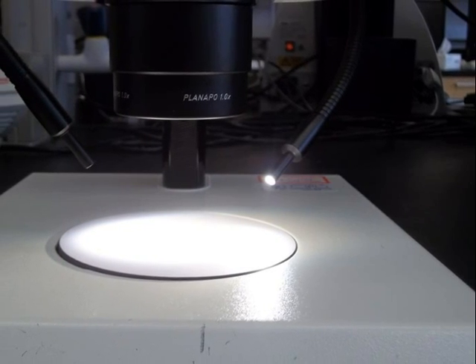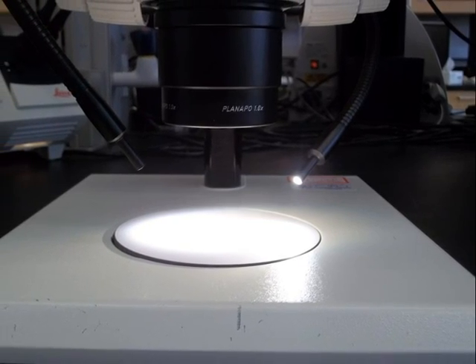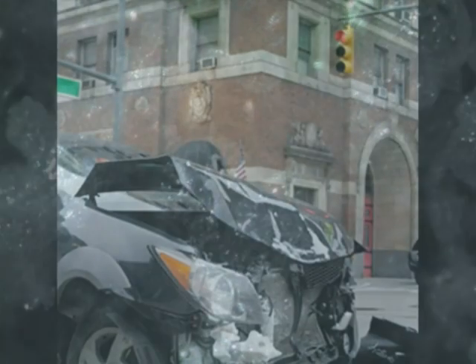An important characteristic of stereomicroscopes that is also beneficial in forensics is the large working distance. Samples that cannot be viewed by a compound microscope due to their size can be seen under the stereomicroscope, with room to allow analysts to manipulate a sample.